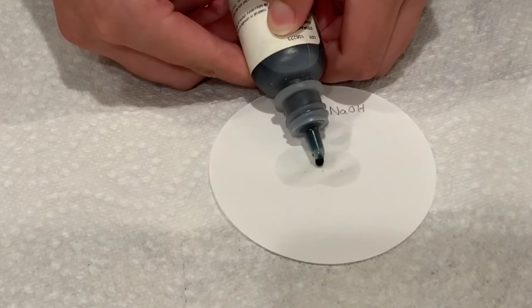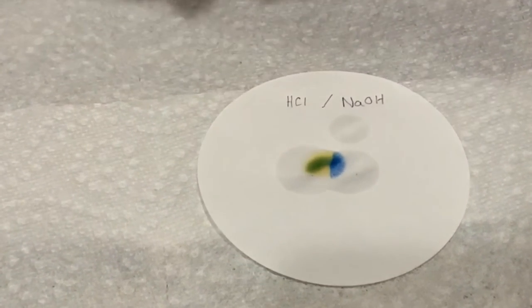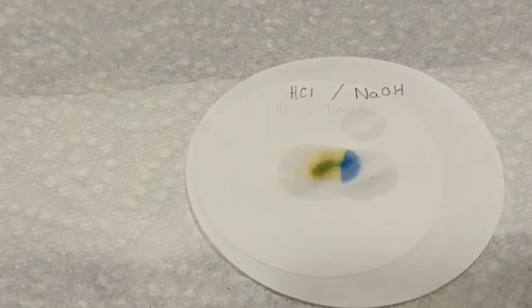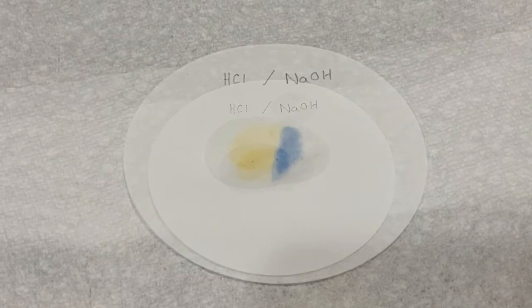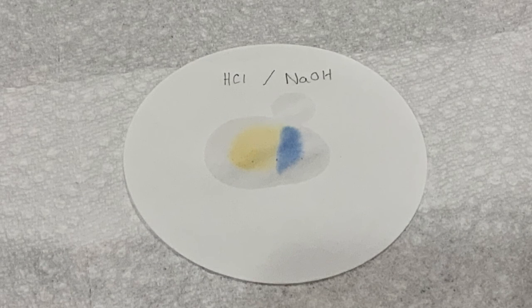Super slow-mo. Right, there we go. The effective indicator on acids and base. You can see that the blue solution is a basic solution, the yellow is an acidic solution, and green is for a neutral surface.